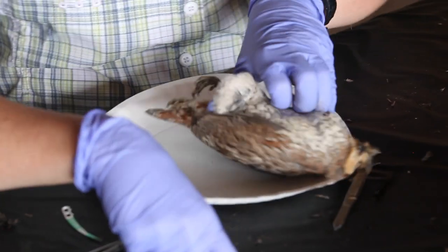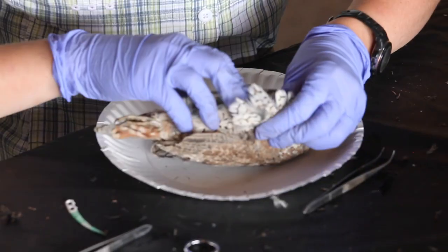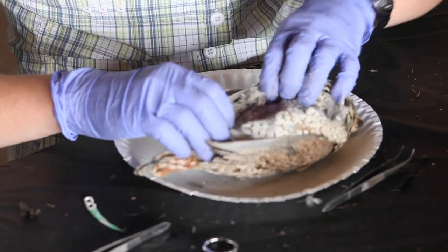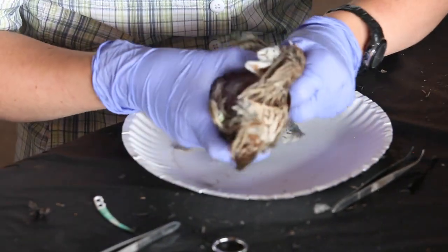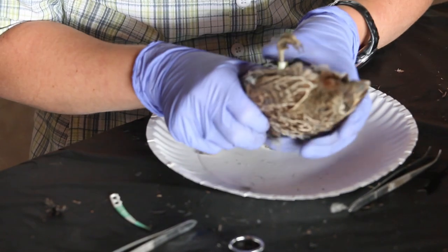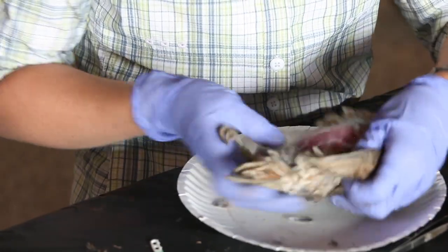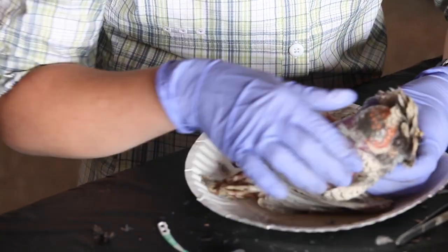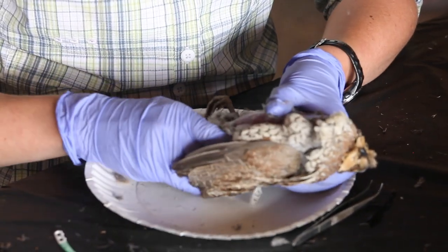So we're going to want to just open the bird up, skin it back, get to the breast. This bird's still a little bit frozen, but it's not going to cause us any problems. I typically will pull back the legs too, just to get it open, get us a good view. So we can see that it's got a full crop. Again, this was a bird that died as a result of our trapping and banding from stress. And so you can see its crop was plumb full of milo, and then it died before we got it processed.